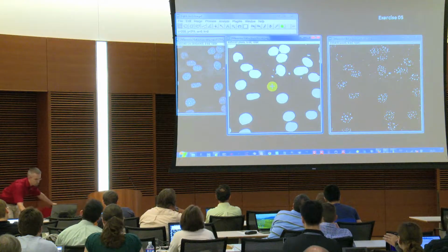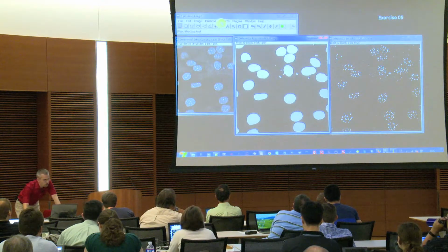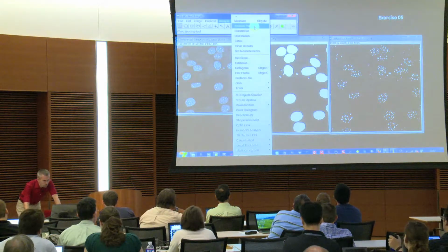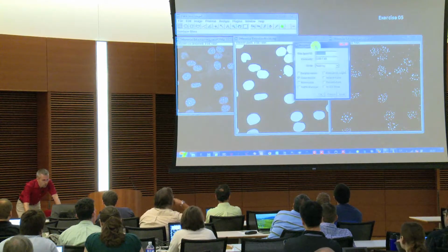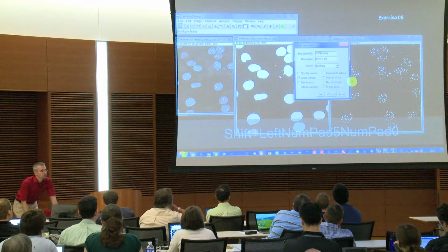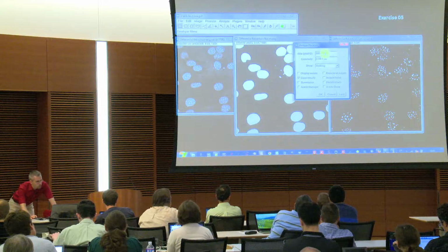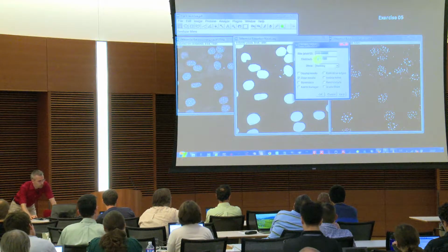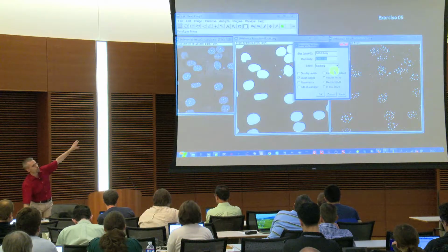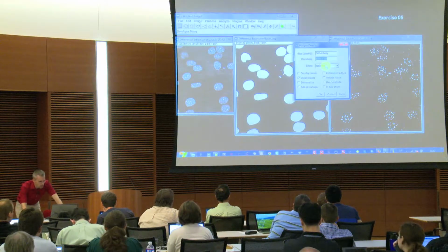So we basically now use the tool Ari showed, the Analyze and the Analyze Particles. We tell the program as measured, everything smaller than 500 pixels should be eliminated or excluded from the analyses. We have no upper limit, therefore we keep infinity. The circularity is not needed here because we don't have any elongated features, which is where it is helpful to use the circularity. So here we can keep that at the standard.